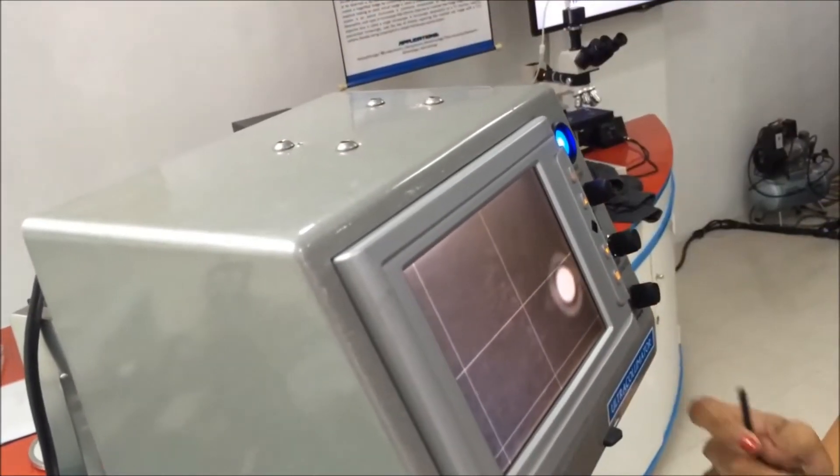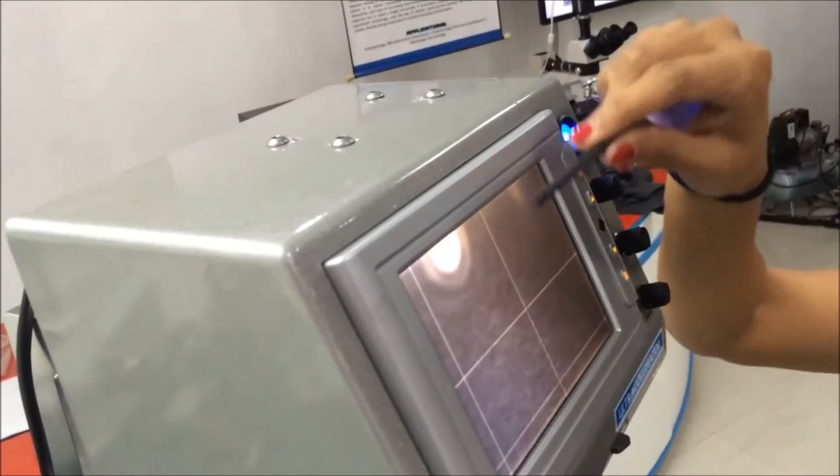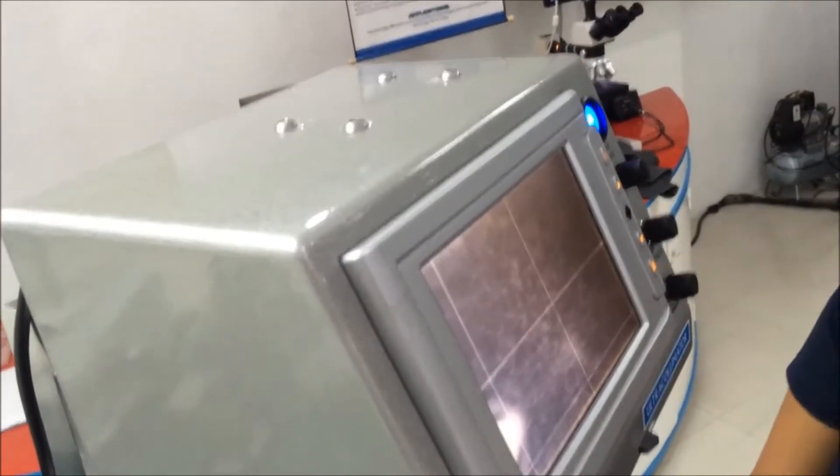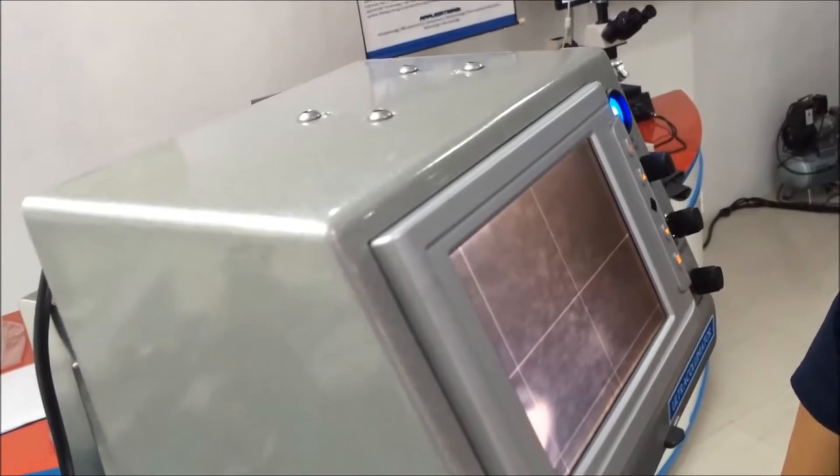Now if you rotate, you'll see that it's actually rotating inside of the screen. You kind of zeroed it around the cross head. Yes.